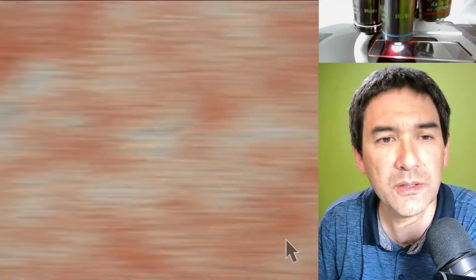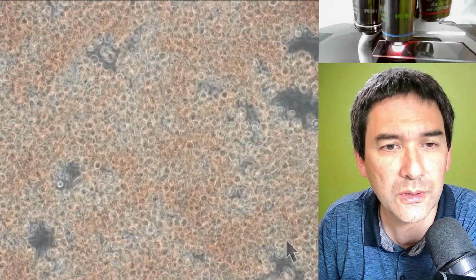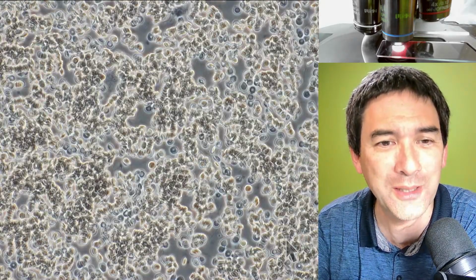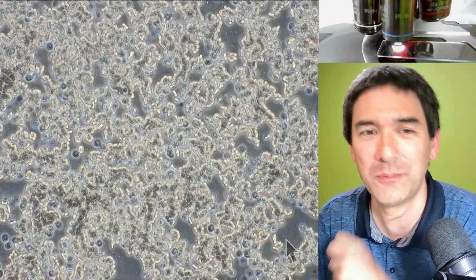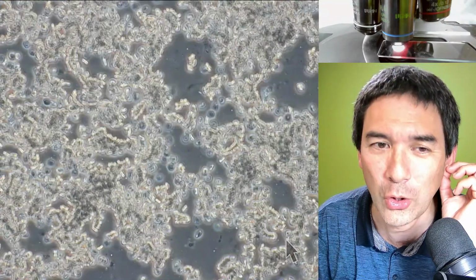Actually, this blood is not spreading quite as nicely as I hoped it would. It's also quite interesting, the consistency of the blood depends quite a lot on whether you have been drinking a lot of water just recently or not. Remember, once I was at the doctor's, they had to take some blood from my earlobe to do some kind of analysis, and they could not draw any blood.